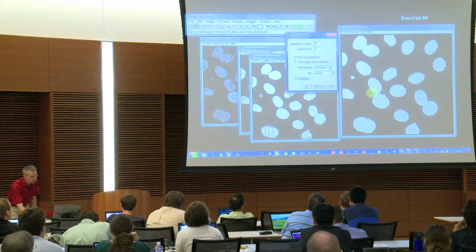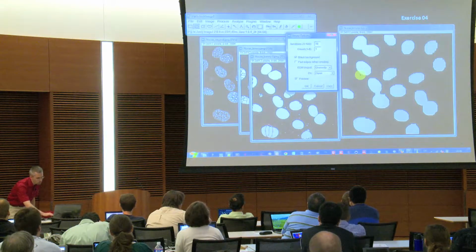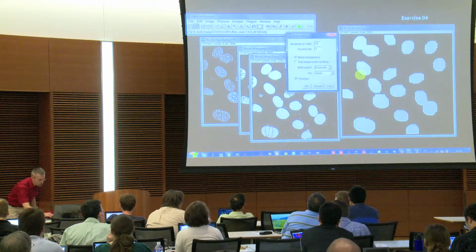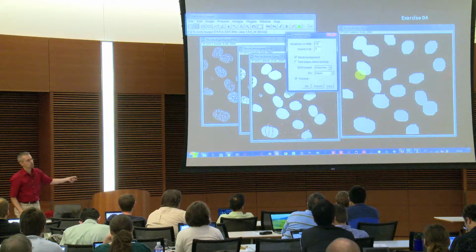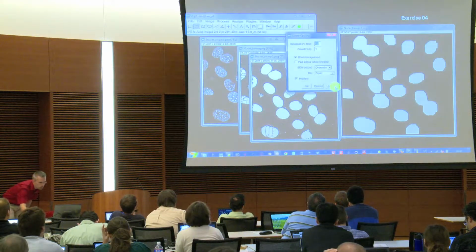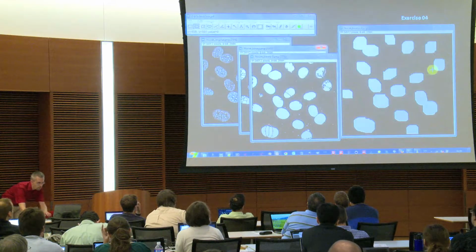I still have those connections. If I actually go a little bit higher, not really. Yeah, now with 12 or 15, then you see these are at least separated, but now it gets very, very blocky. So we can keep that for now first. We'll do that 12 or 15 times and accept that.